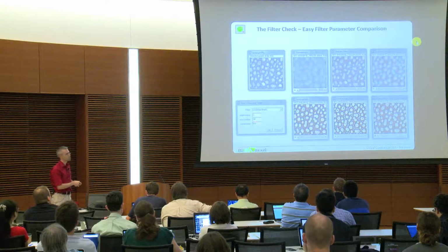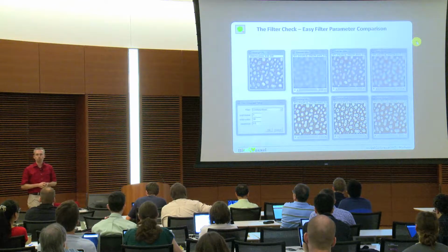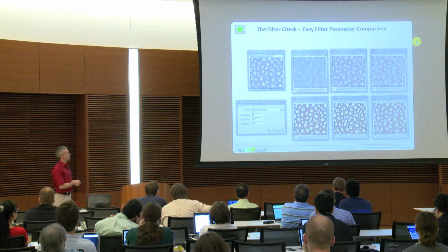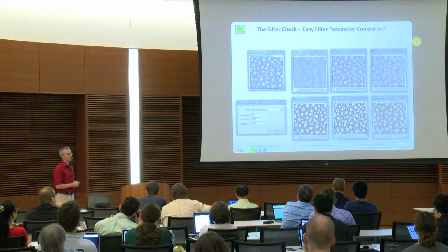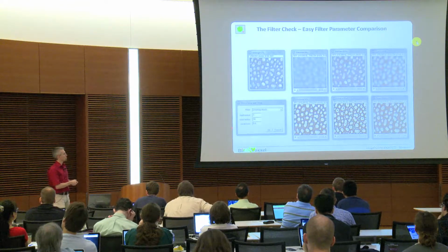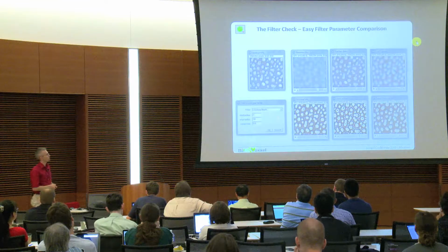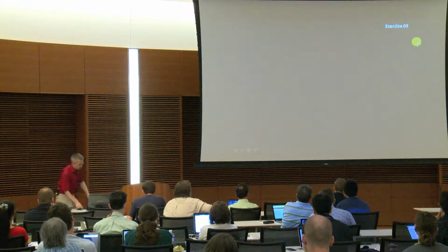The parameter function is ignored by all filters which only use a radius. Some filters, like the mentioned unsharp mask, actually need a weight function, and this is then when the parameter comes into the game, but normally for the standard filters you don't need the parameter. Only mean shift and unsharp mask, for example, uses the parameter. So we can test that.